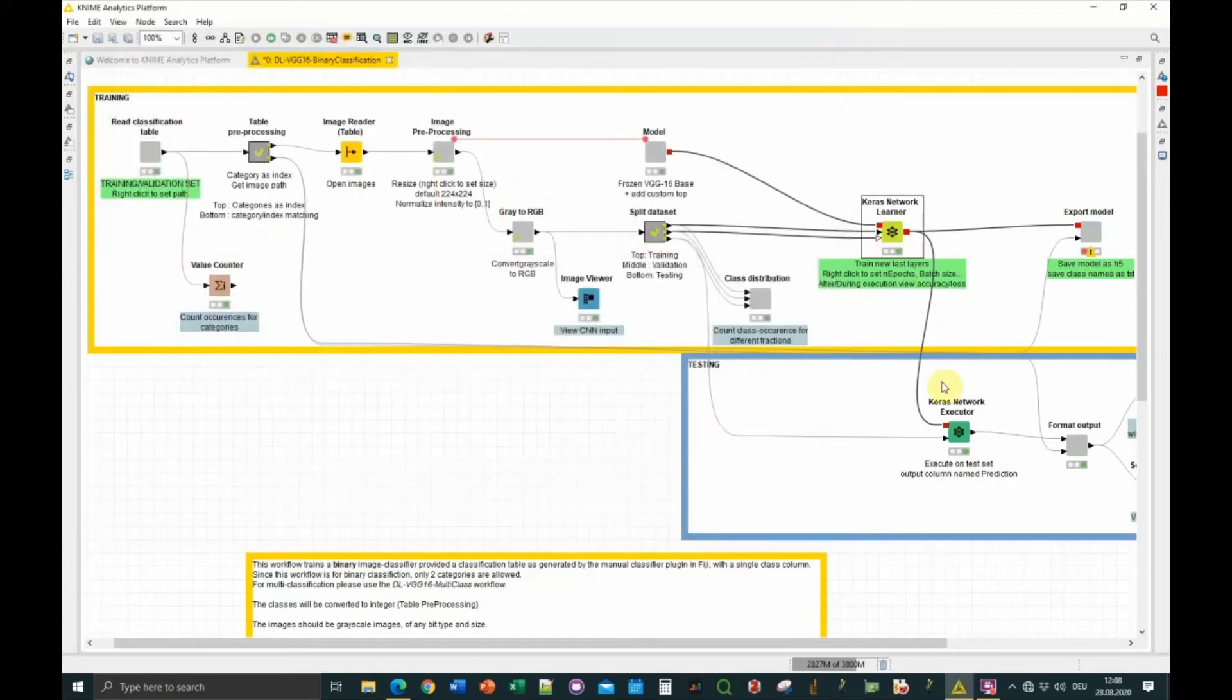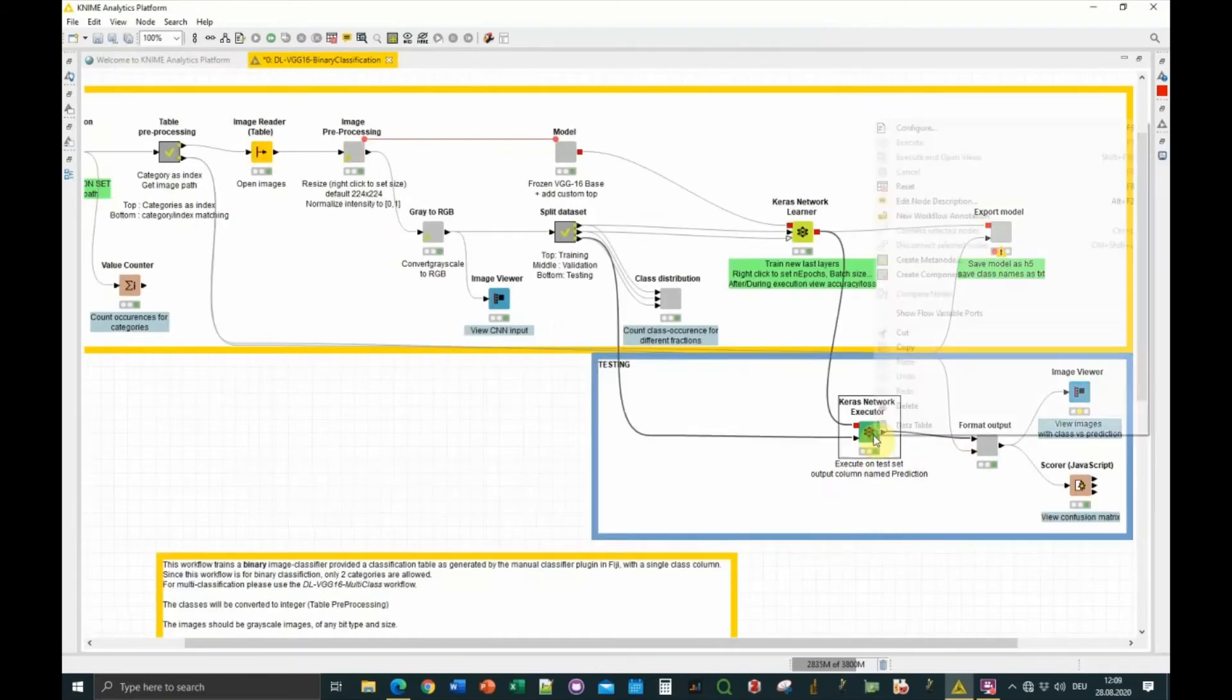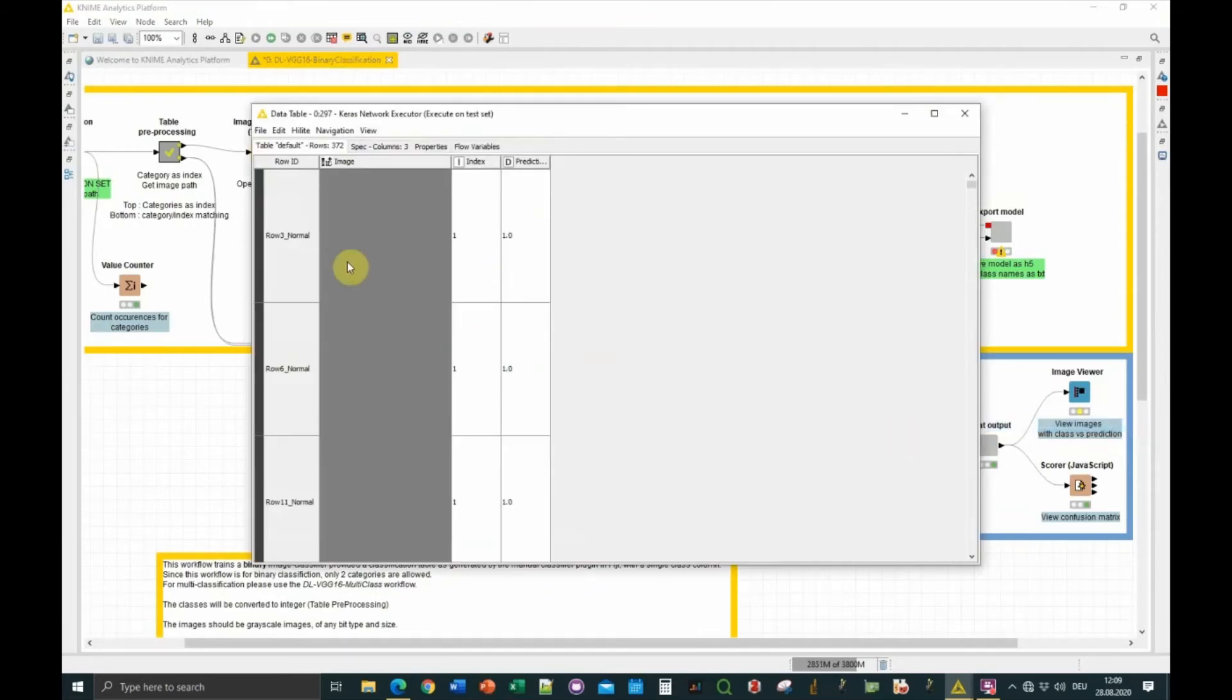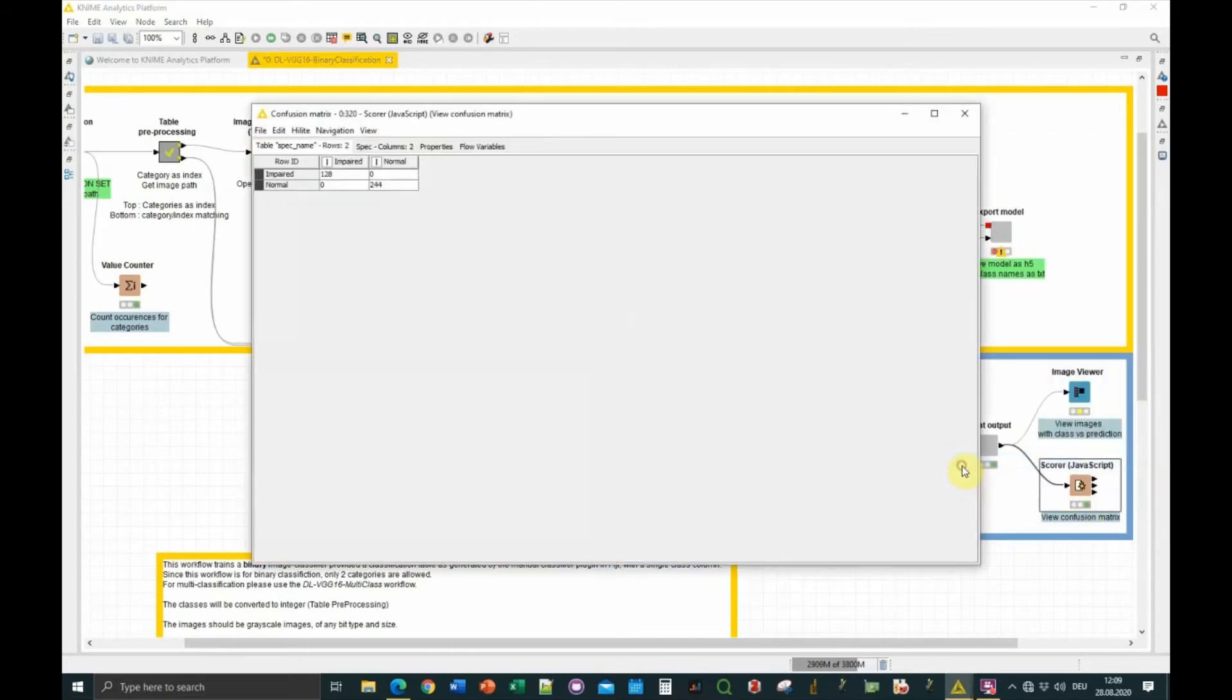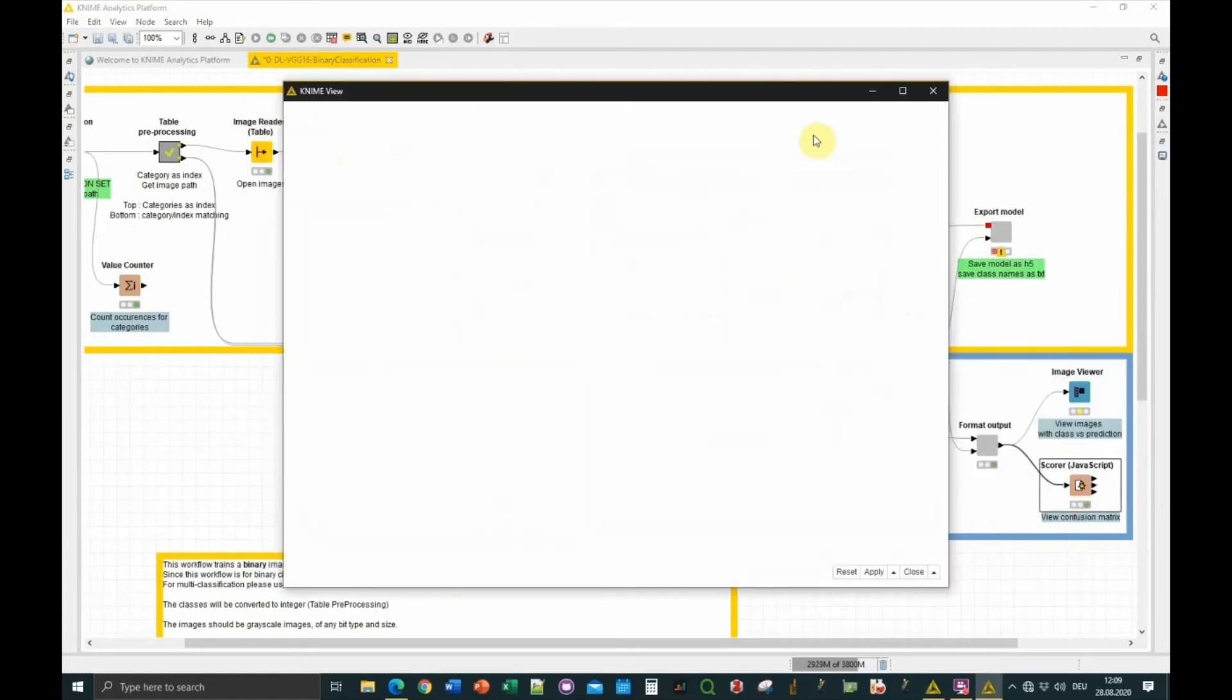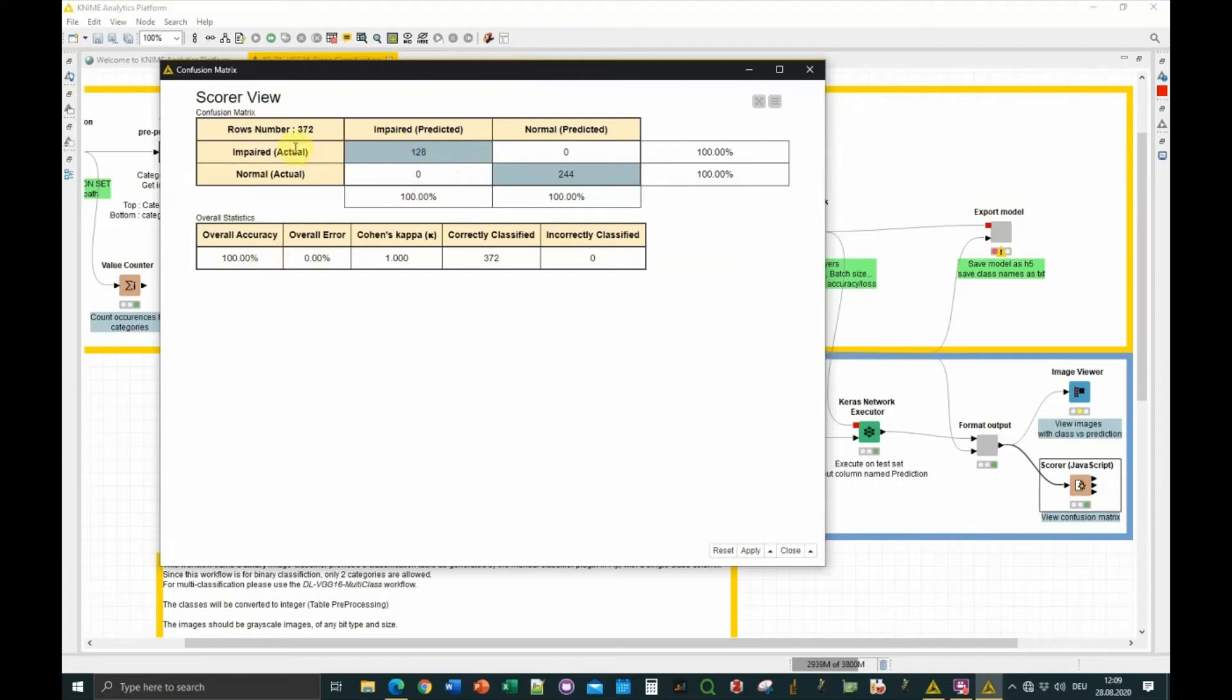Once it's trained, the accuracy is checked on the test fraction. You can see the image, the initial category, and the prediction. Then it's formatted so it's easier for you, and you can visualize it as a confusion matrix. In this confusion matrix, you can see the actual category of the image and the prediction. In this case, the accuracy was 100%, so all the impaired were classified as impaired, all the normal were classified as normal, which is pretty good.